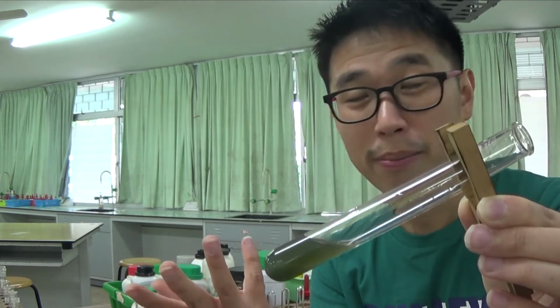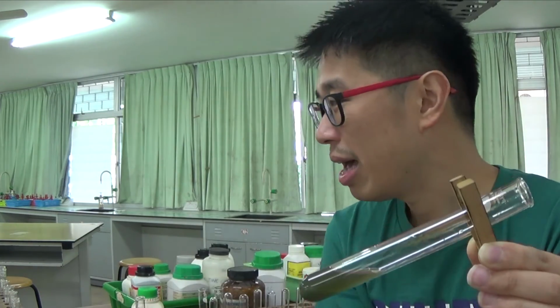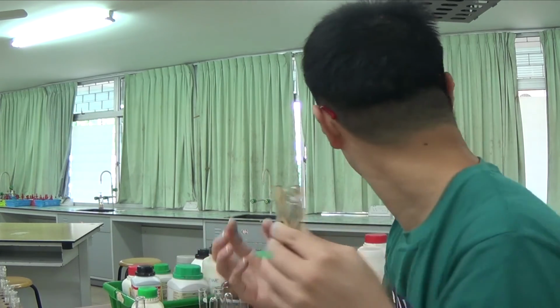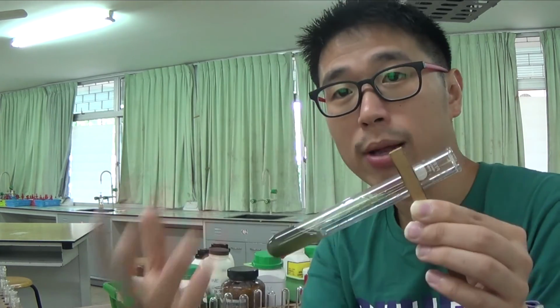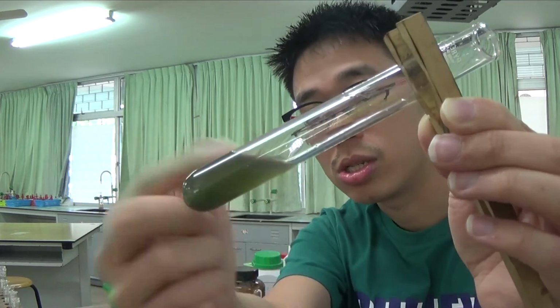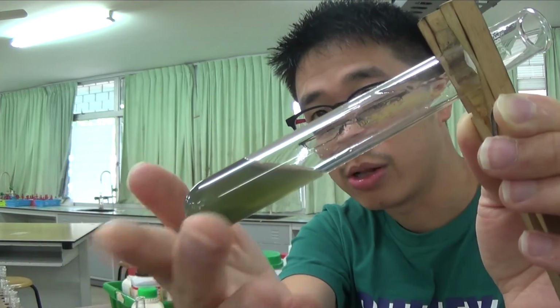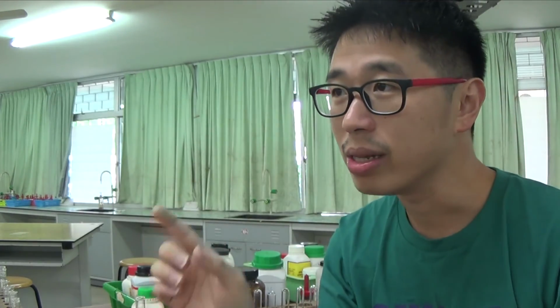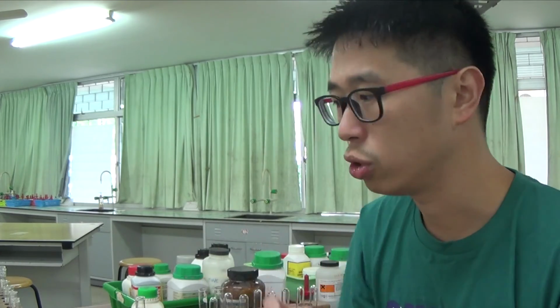You cannot, because calcium hydroxide, aluminium hydroxide, zinc hydroxide, those are all white precipitate. And if they are white precipitate, then it's very hard to see the color in the background of these colored compounds. So that's why it's difficult to identify those cations, but it's easy to identify ammonium cations.